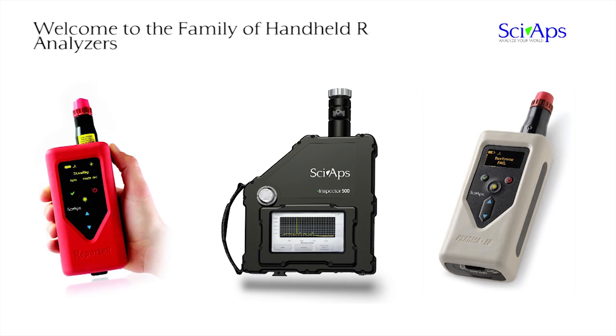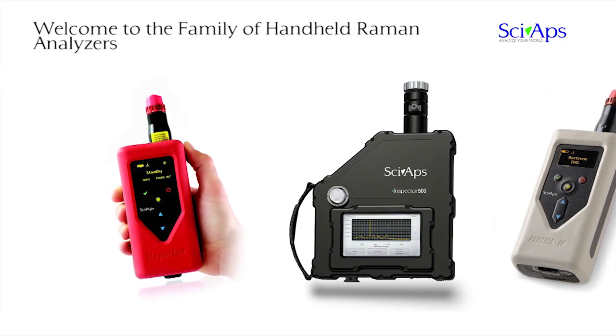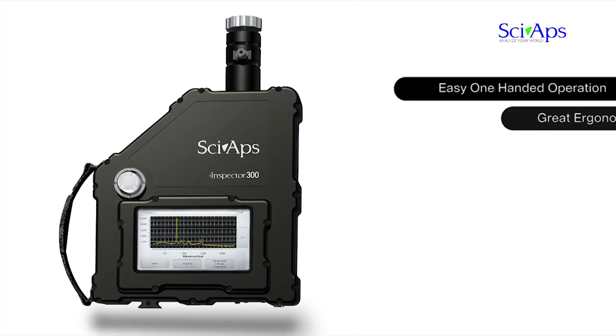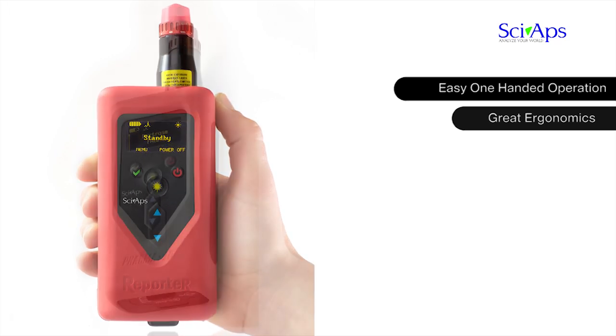Welcome to the family of handheld Raman Analyzers, brought to you by CyApps Incorporated. One of the many unique features of our Raman products is that we offer a family of handheld analyzers to satisfy virtually any price and performance budget.